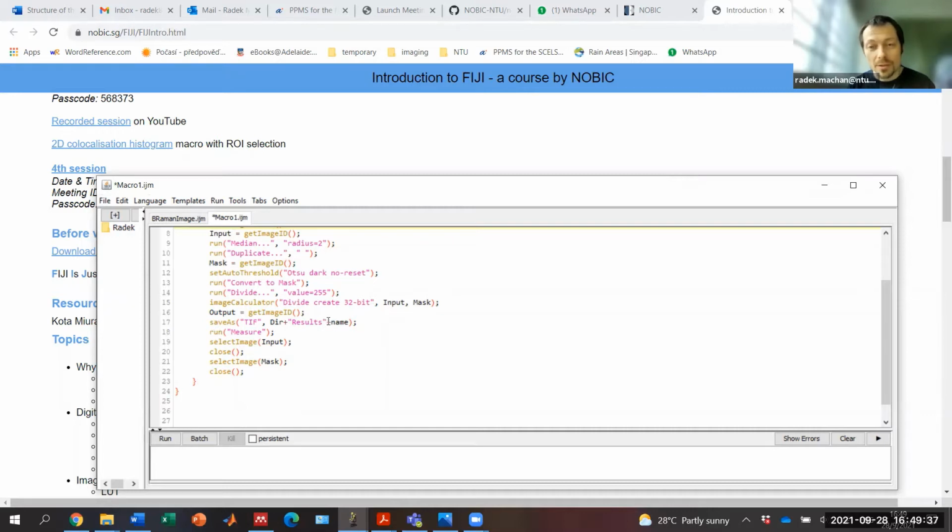But now, this is not yet correct. If you remember, when you give a path to a file, there always has to be a backslash between the directory name and the file name. If I put a backslash here, you can notice that now it looks weird. The reason is that backslash changes the meaning of the quotation marks and so on, so we cannot use that.